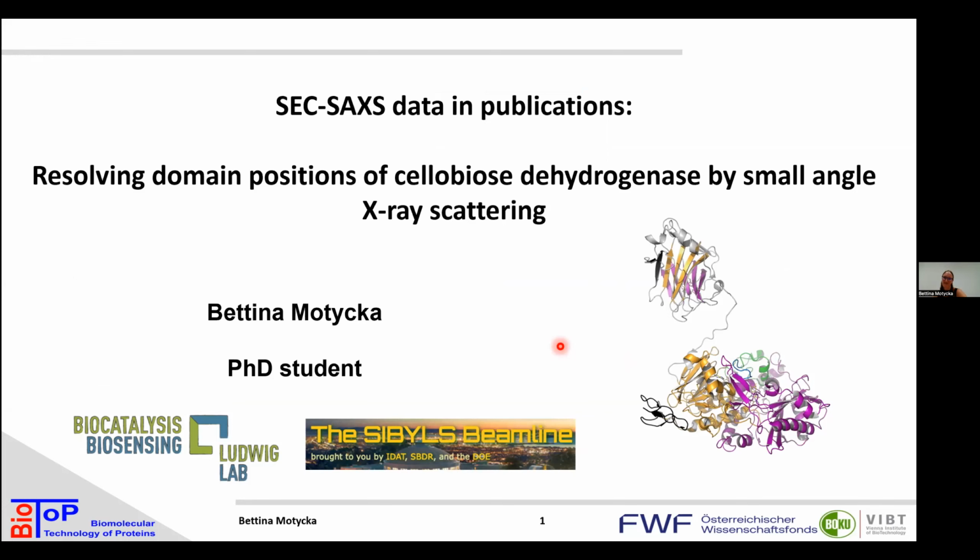Thank you for the nice introduction, and thanks again for the honor to give the talk now, and to be my external research, and I really enjoyed the time with you. Today I want to talk about SAXS data in publications, and all the data I'm presenting today were recorded or generated and analyzed at the SIBYLS Beamline. The paper I want to talk about today is Resolving domain positions of cellobiose dehydrogenase by small angle X-ray scattering.